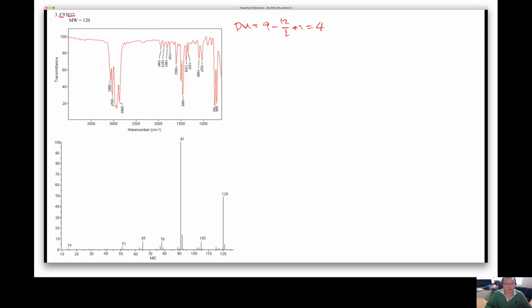That's somewhat significant. In the NMR, we do see some unsaturated signal, right? Hydrogen on double bonds. But this double bond can also be part of a benzene, so we don't know whether this is just regular double bonds or a benzene.